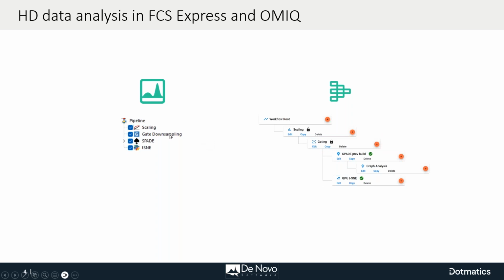So again, in my first part, we will use FCS Express. We will go through scaling and downsampling, not actually gate downsampling. We will see something a little bit cooler. And then with Jeff, you will go through dimensionality reduction, UMAP, and clustering, FlowSOM.